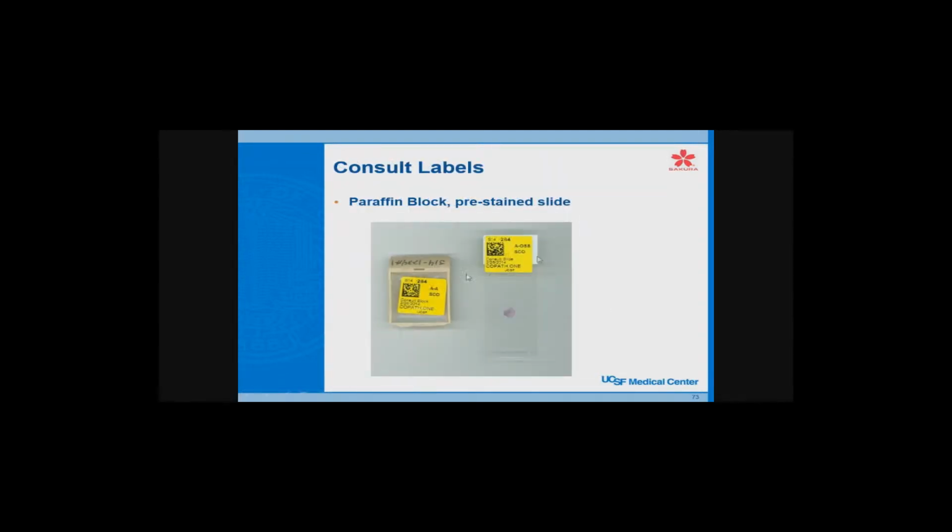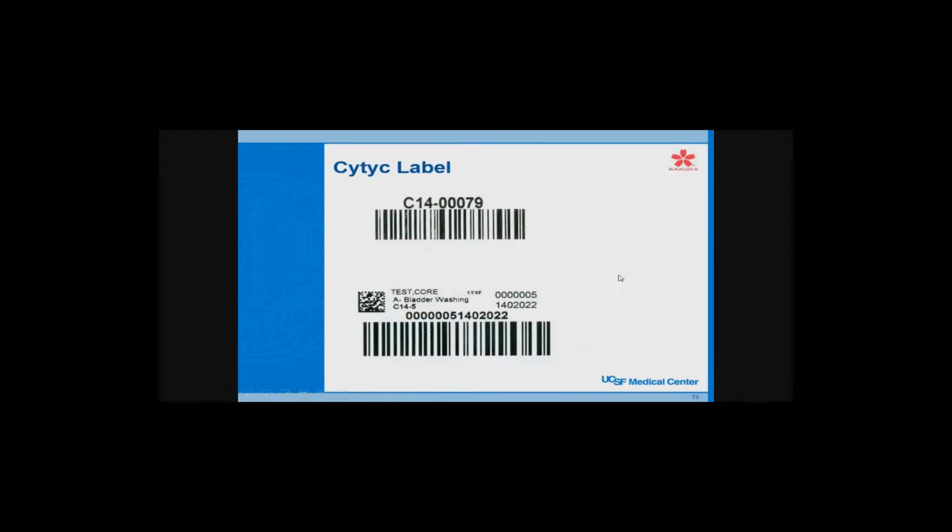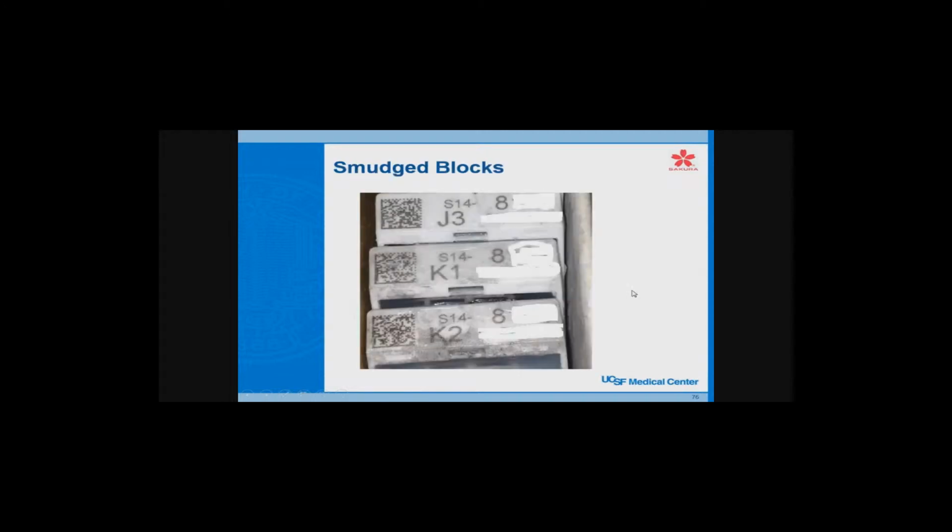So at the end of this, when you finally go live, nothing is perfect, so you're going to have some problems. The big thing is to start an issues log and perform the analysis. This is our issues log that we had set up. People just go up and write up any issue that they had with the system, and then we would, as soon as possible, try to resolve it.